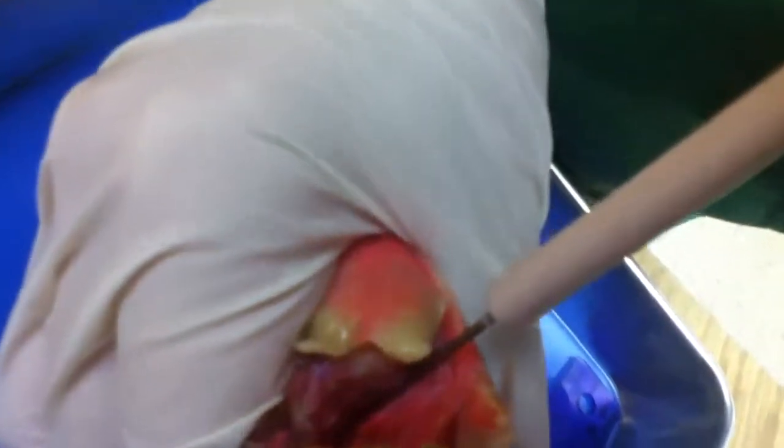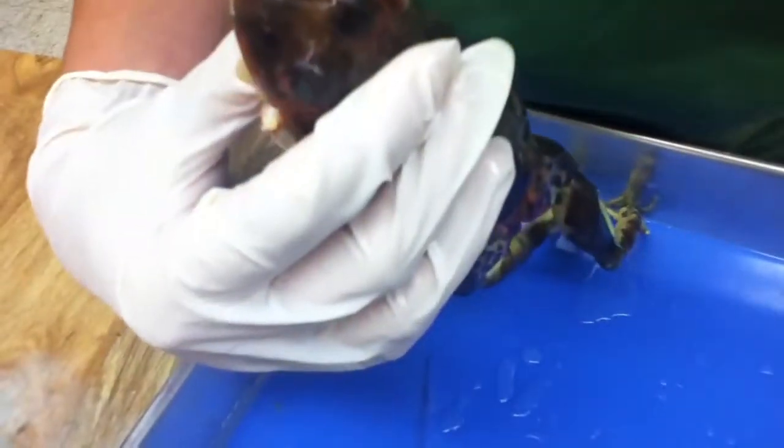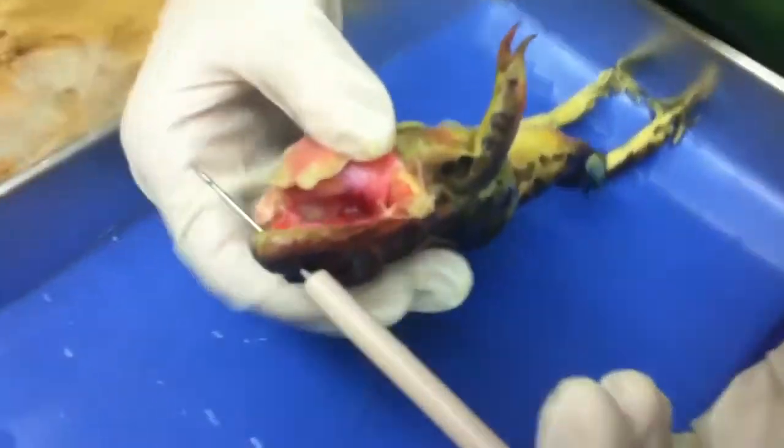Maxillary teeth. Right here? Does it really feel like sandpaper? Yes, it actually does. Alrighty. Internal nares. We already found those, they're right here. They are right there, where the needle's going to. Yep. He got a piercing.